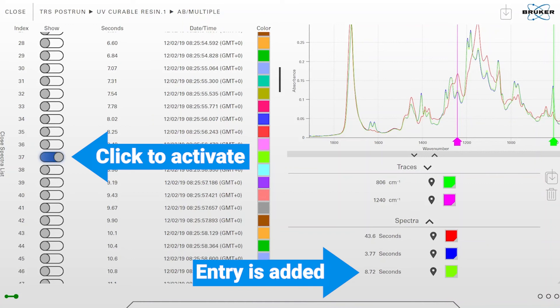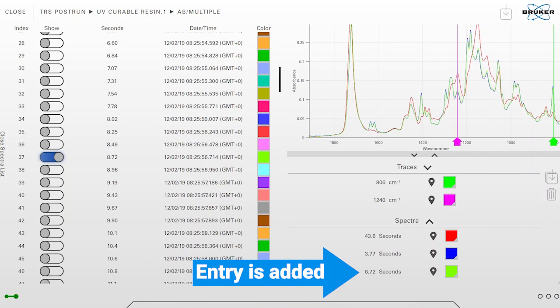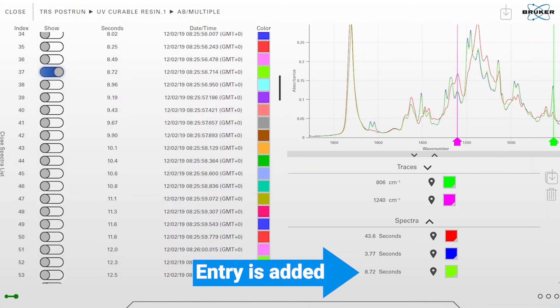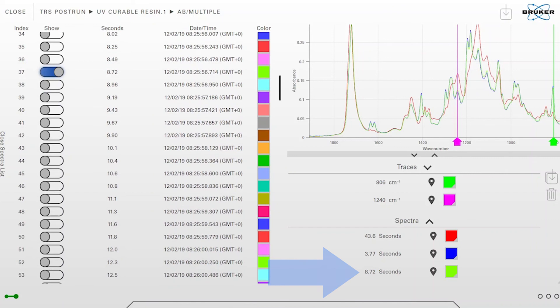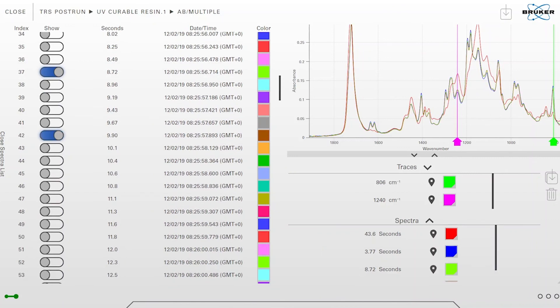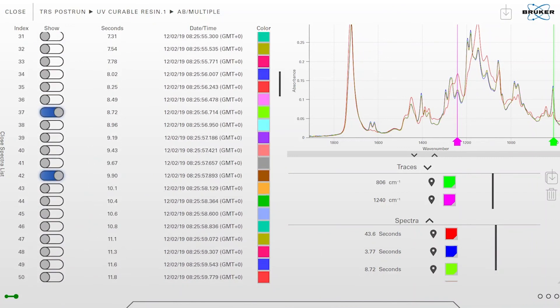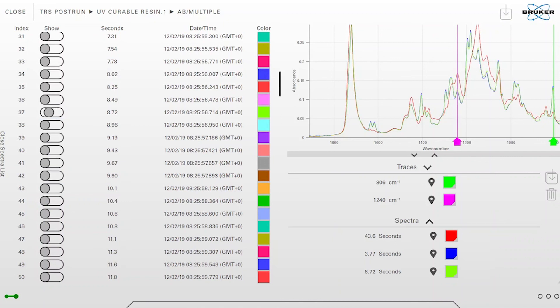And also on the lower right corner you can see there's an entry added in the spectra list. Then I can add additional spectra if I want to or deselect them, and if I have individualized everything I can close the spectra list again to get back to my full view.